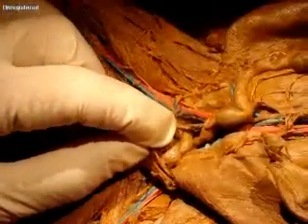Alright, what else? Small intestines, you all know what those are. And somewhere in here, there's the large intestine. Somebody asked me about the cecum the other day. It's easiest if you find the appendix. And you guys have disguised your appendix. What'd you do with it? So here's the cecum. Here's the appendix right here. And then here's the cecum. This first part.